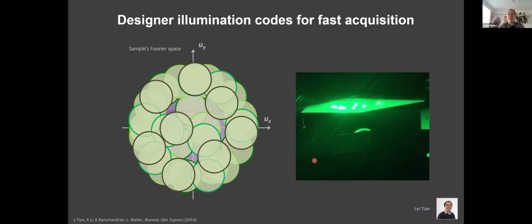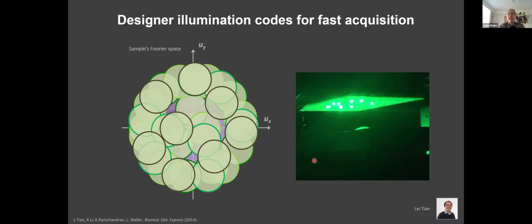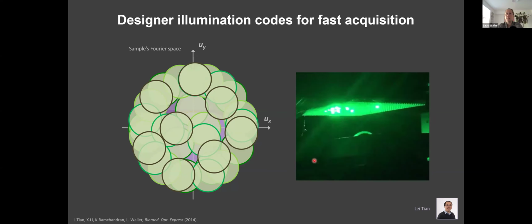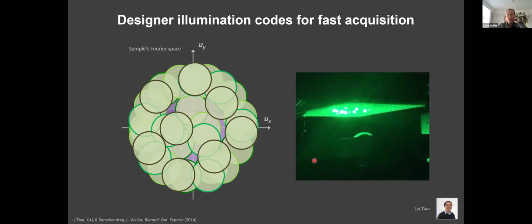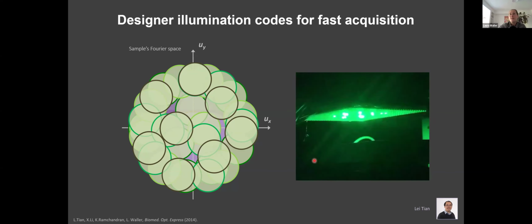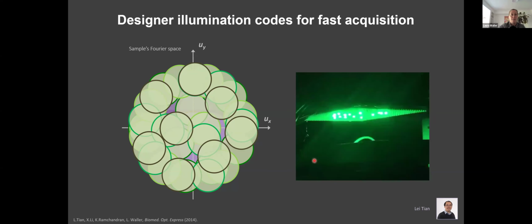Because we're turning on 8 LEDs at a time, that's what this disco party pattern was, then you can take an 8 times shorter exposure time, and you're filling in 8 different parts of the Fourier space with each image, sort of, hopefully, as long as the algorithm still converges. But it does for the factor of 8. So you can reduce your capture time for data by almost 2 orders of magnitude just by doing this multiplexing approach. So this was really valuable to get at fast sampling.